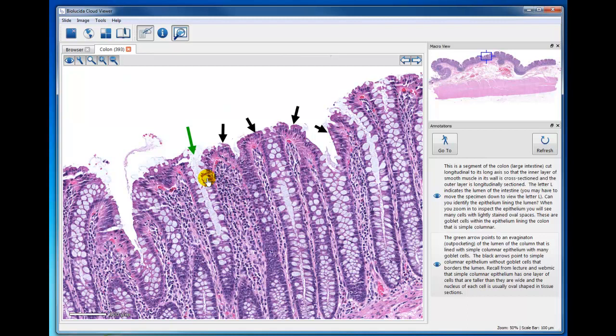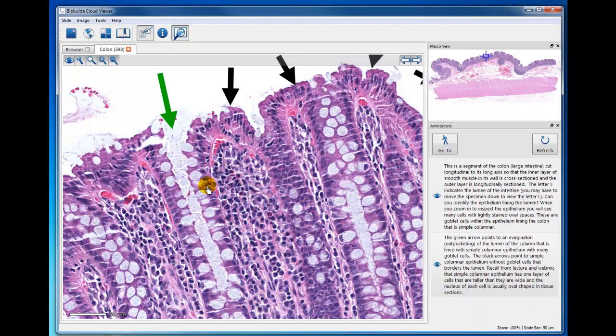But you are responsible for recognizing epithelium. So when you zoom in on something like this and you see there's only one layer of nuclei, and each cell is connected with the other cell with nothing in between, you have to think epithelium versus connective tissue, muscle, or nerve. Right now you're studying epithelium and connective tissue and adipose tissue. So epithelium has no space between the cells.